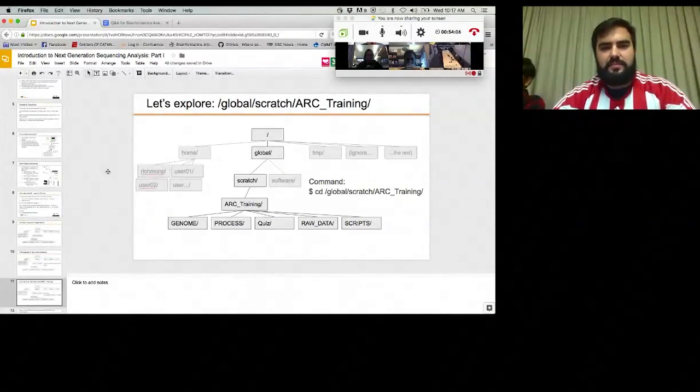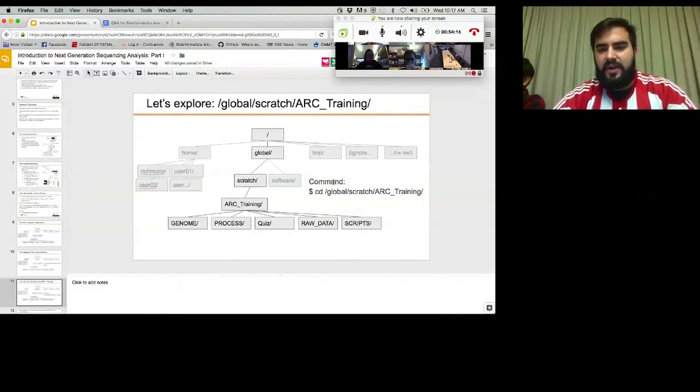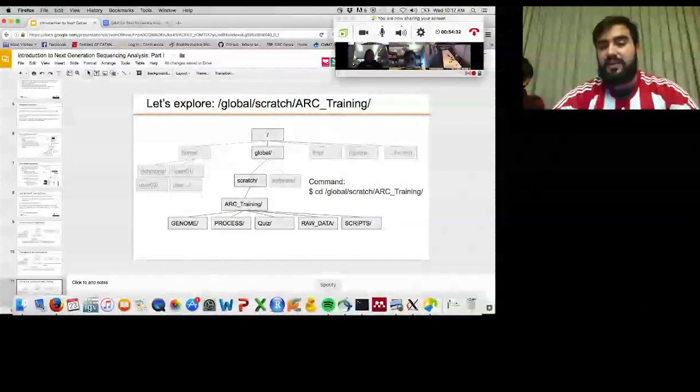So let's go ahead and explore the workshop directory in global scratch arc training. A quick note for those of you that are new to Linux, I will often have the commands that I need you to type, for example, to explore global scratch arc training. Most of you have completed the quiz, so this should come as second nature, but it's nice just to have a little bit of a refresher if you need it.